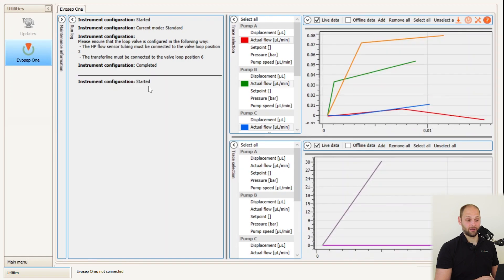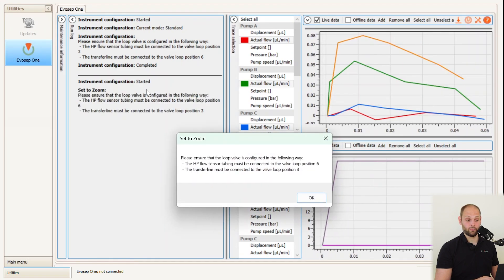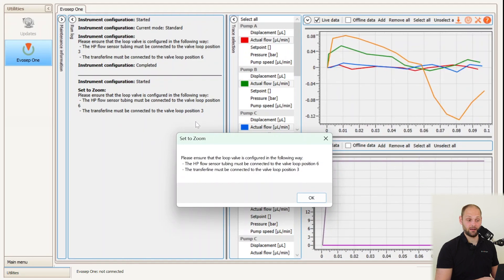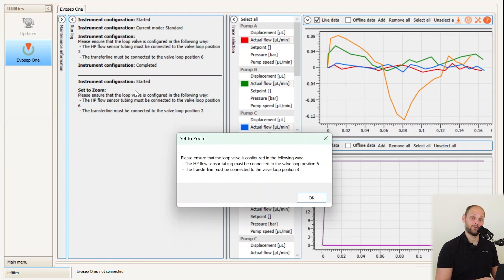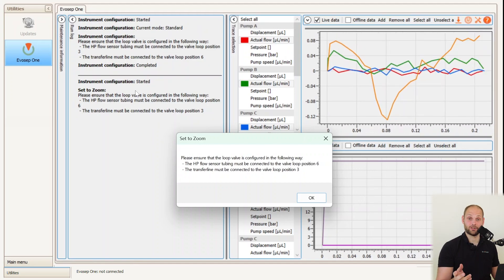After the configuration has finished, we'll be presented with this information informing us that we now need to manually reconfigure the plumbing on the loop valve, which I'll now show.